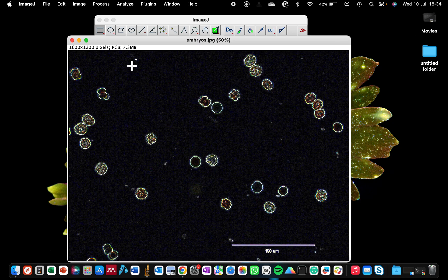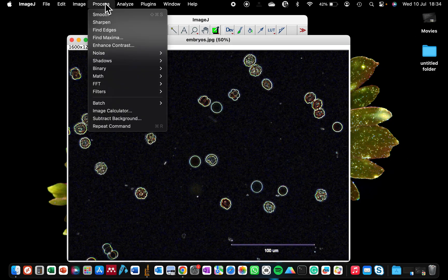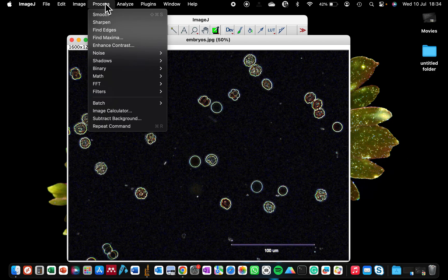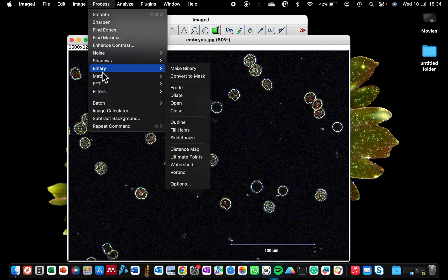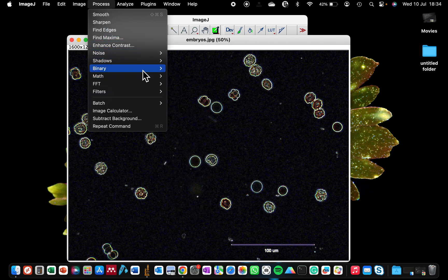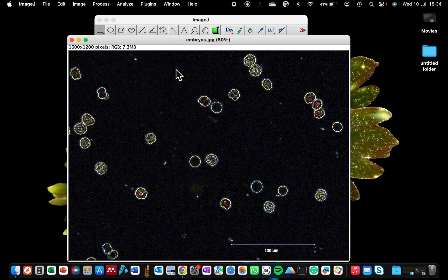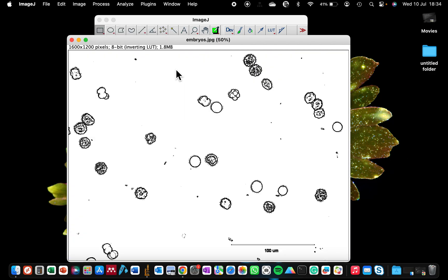The next we want to tell ImageJ is that now that you have found the edges, we want it to make the image a binary image. So you go to Process, Binary, and tell it to make binary. Now it has removed the coloring, the yellow background of the image that we had earlier, and also the colors inside of the cell. So we have the perfect edges of each of these cells.